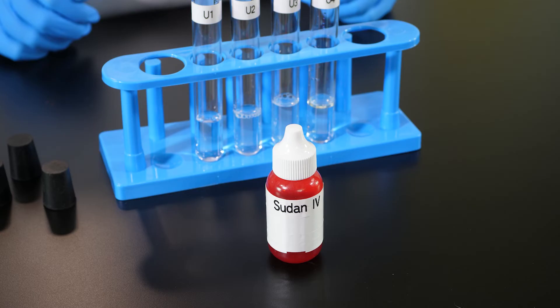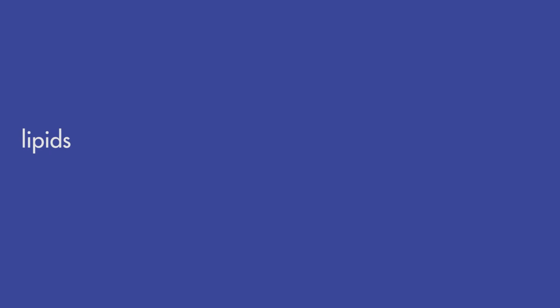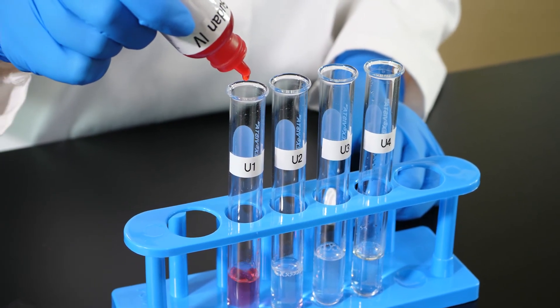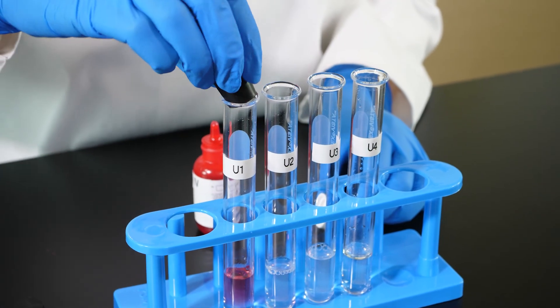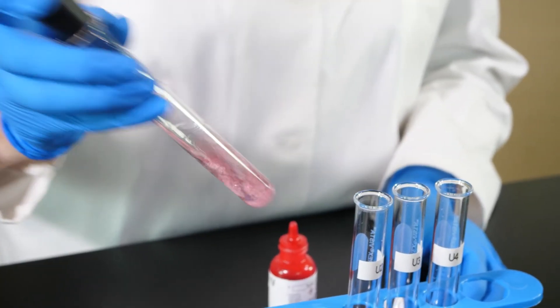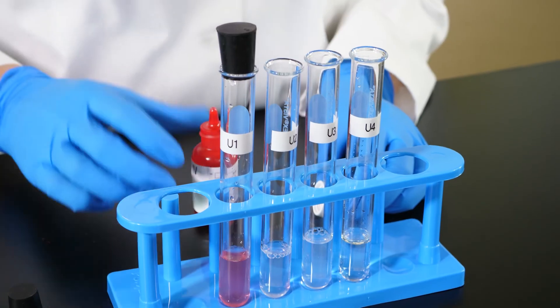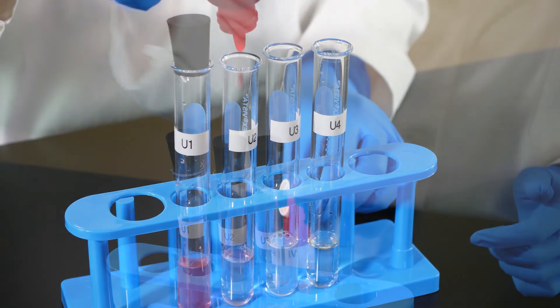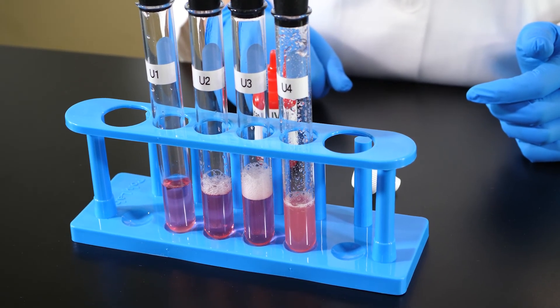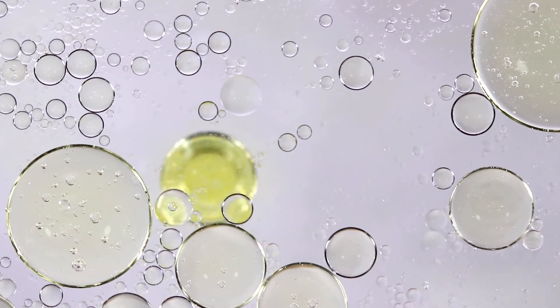Sudan 4 is a red dye that turns any solution red. But if lipids are present in the solution, a positive reaction between Sudan 4 and lipids will occur, and the lipids will turn dark red. We add 20 drops of Sudan 4 to a sample of each of the unknown solutions. Since lipids do not easily dissolve in water, we need to shake the test tubes vigorously to mix the Sudan 4 with any lipids. Any lipids present will eventually separate from the water and form a layer on top, since lipids are less dense than water. If we see a dark red layer floating on top of the water, we know lipids are present.